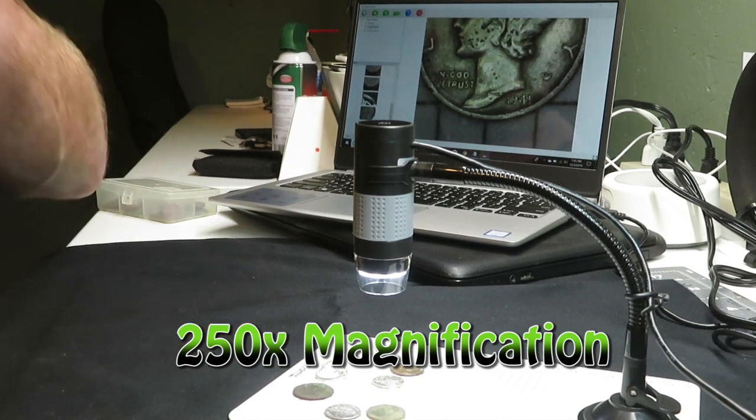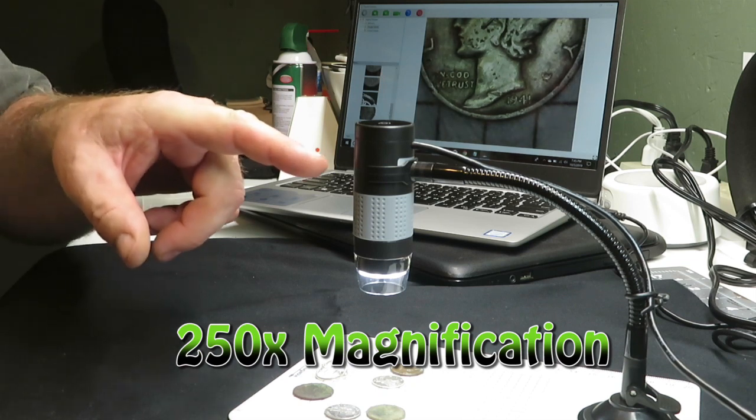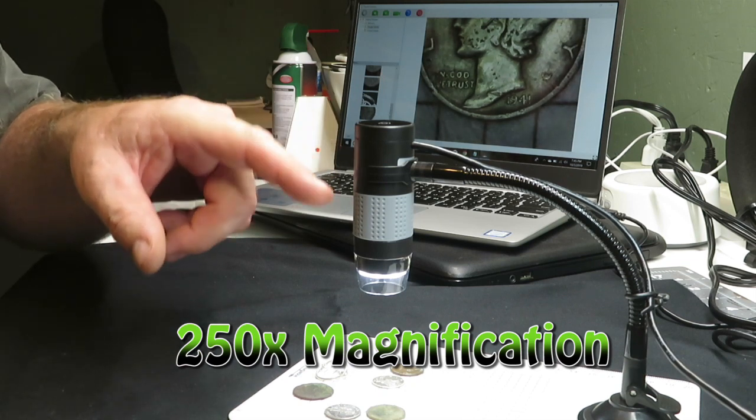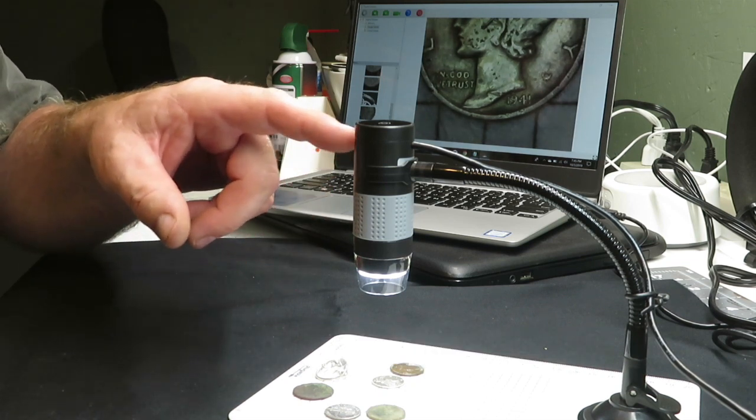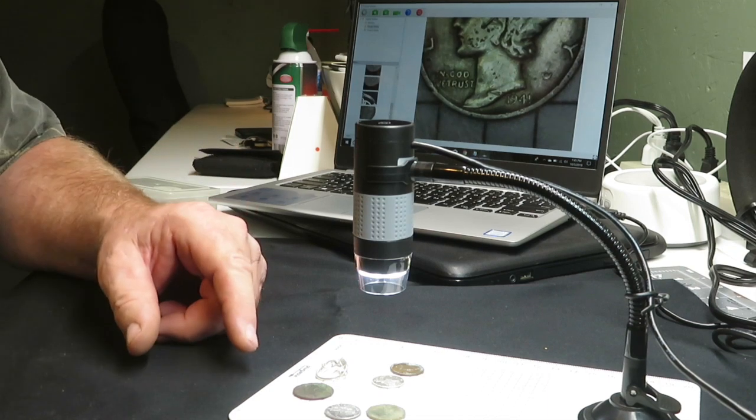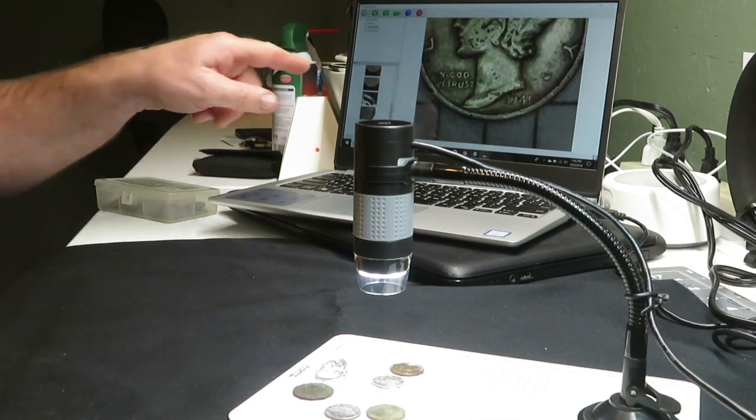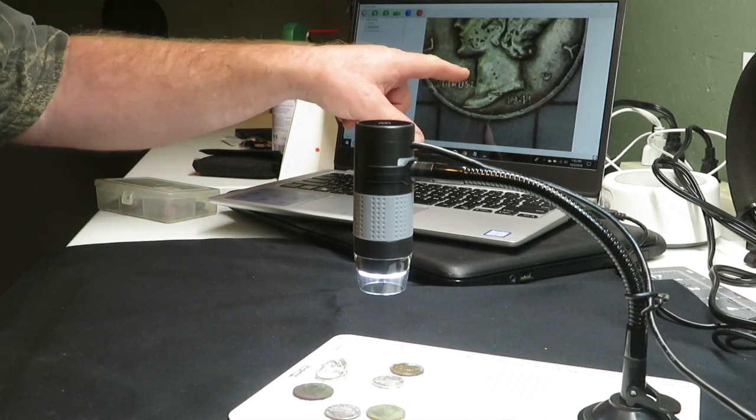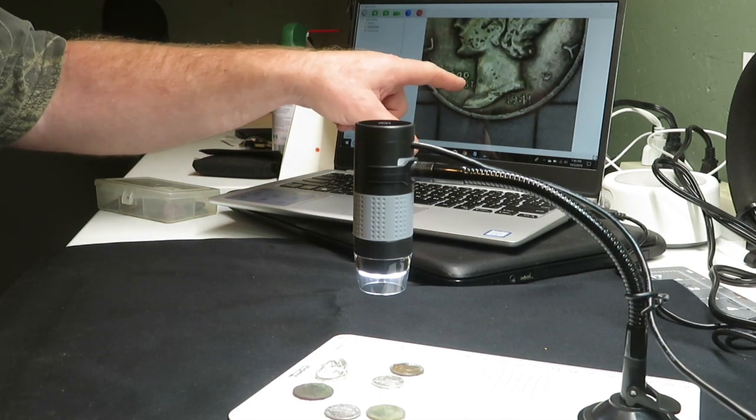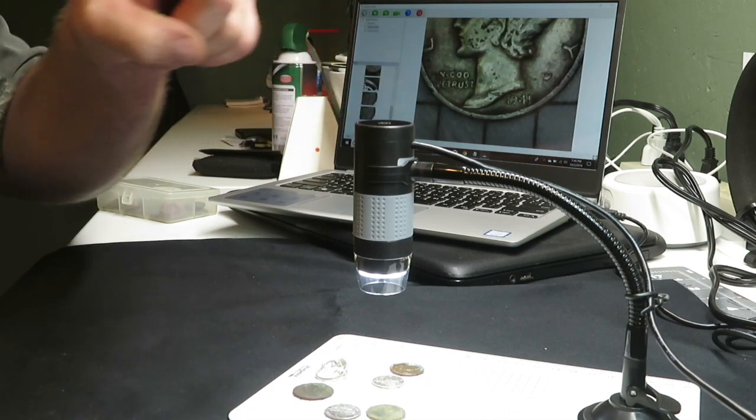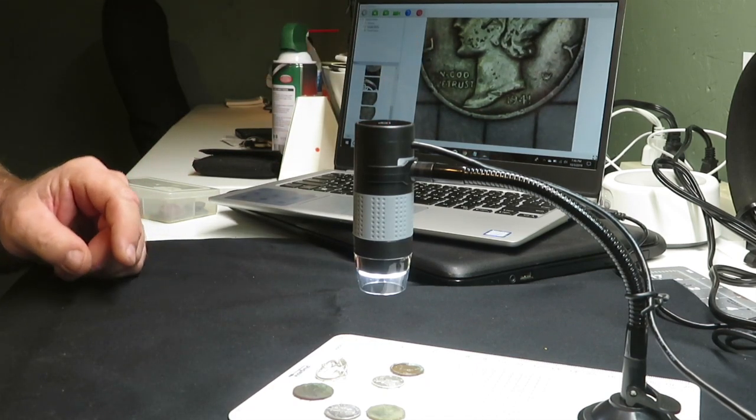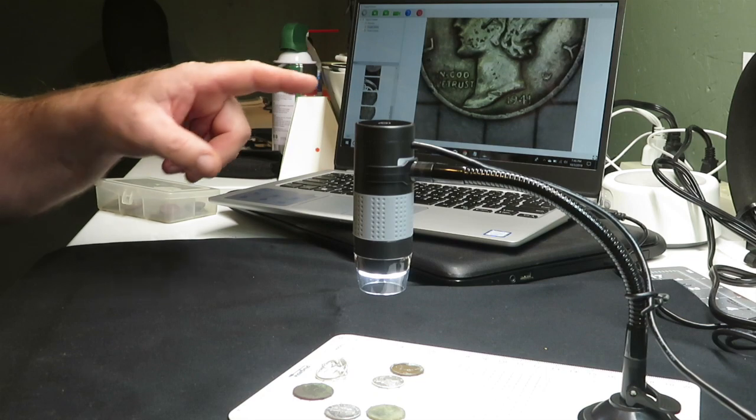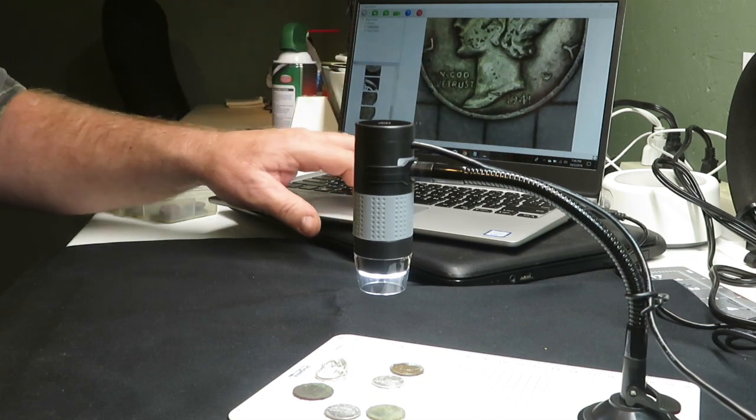This guy will take pictures, it's up to a thousand times zoom on it. It'll actually take pictures, it has its own LED light. You can brighten the light, make the light dimmer. You can take pictures with this too. I can snap a picture of that just by touching the top of this and we took a picture of that coin right there.